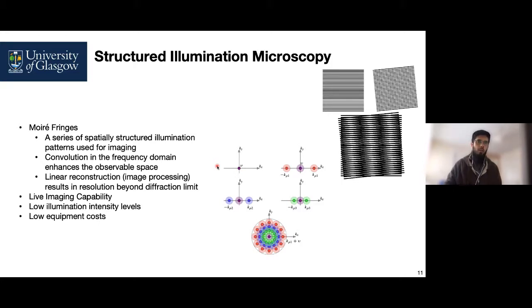But biological samples might be harmed by higher intensities of light, just as we have limitations on exposure to X-rays as human beings. Similar exposure limitations exist for nanoscale or microscopic biological samples, for the limits of light intensities that they can bear.